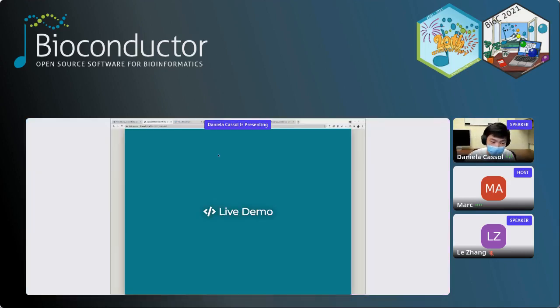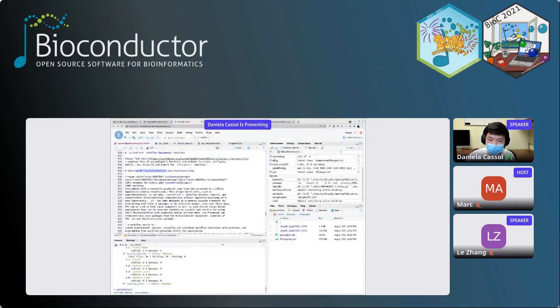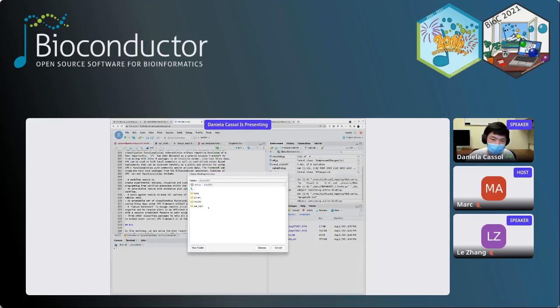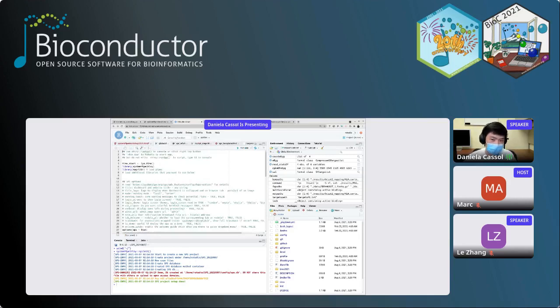All right. So next, I will just demonstrate the Shiny app in the RStudio server we have. First, we clean everything. We change the working directory back to the home directory. And then what we start with is just typing systemPipeShiny. Oh, I missed an S here. And you type SPS init, which means create a new systemPipeShiny project for me. In one second, you will have the project over here.